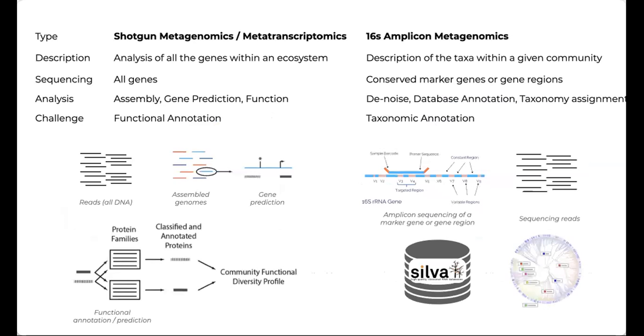So about next generation sequencing, we are primarily going to talk about 16S amplicon metagenomics, but there are also additional types of metagenomic sequencing that are possible that we already discussed, like whole genome metagenomic sequencing.